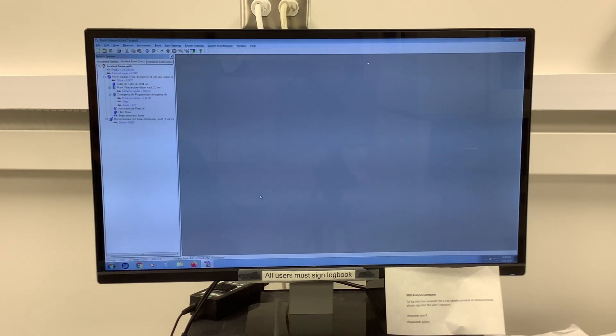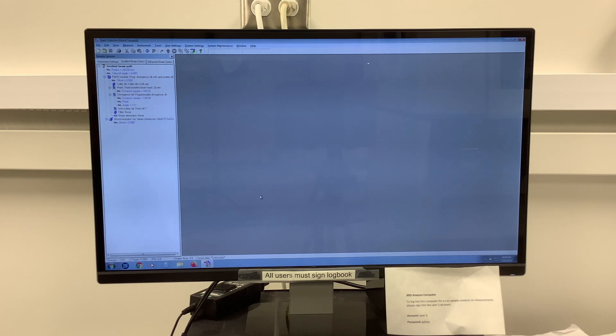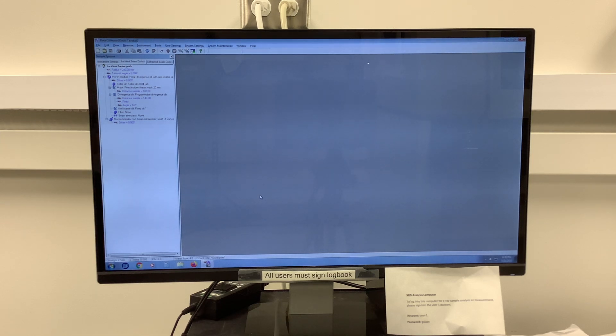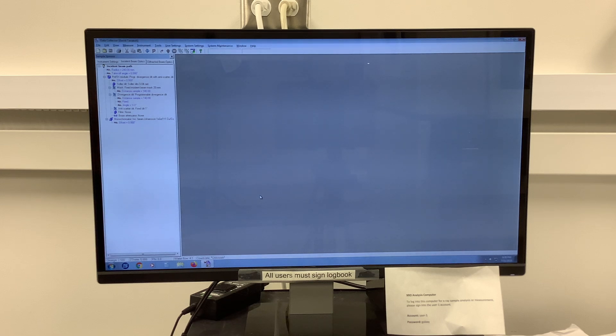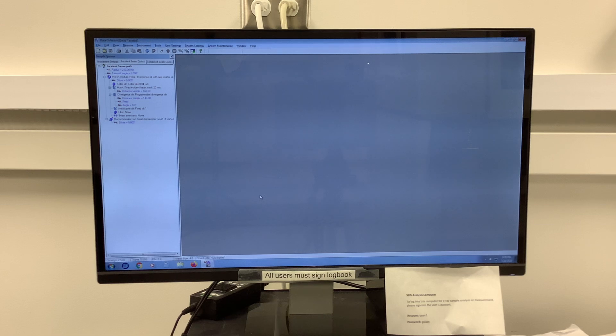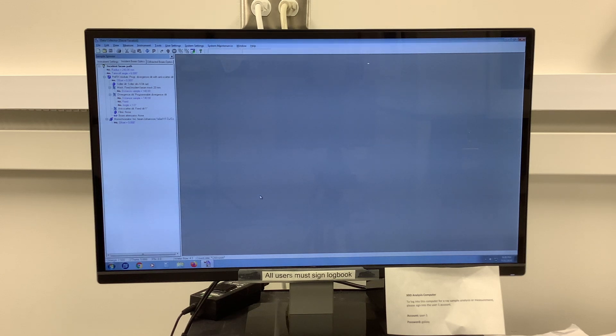In this section, we'll be discussing how to create a program to collect your data. A few assumptions: your hardware and optics have already been set correctly, your powder or material is already placed inside the instrument, and now you actually want to measure it.